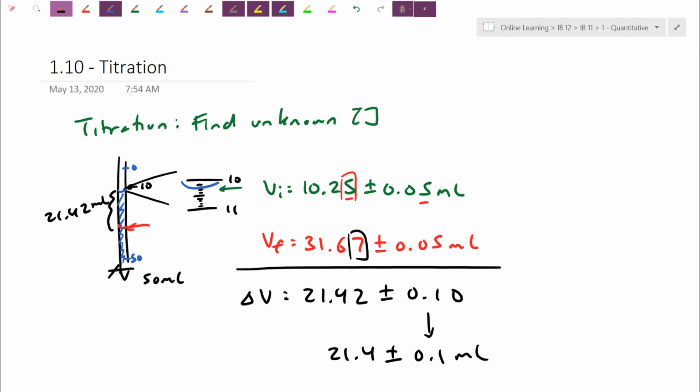It was a little bit hard to get this number. Afterwards, it's just going to end up as a stoichiometry problem. So in this demo here, what we're going to be doing is an acid-base titration. It's going to be very similar to, let's say I have HCl reacting with NaOH as an example of an acid-base titration. We would do a balanced equation. I produce a salt and I produce water. Sometimes the mole ratio is 1:1.